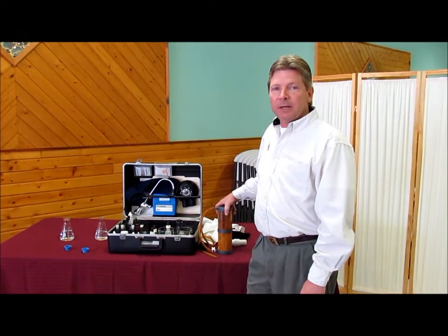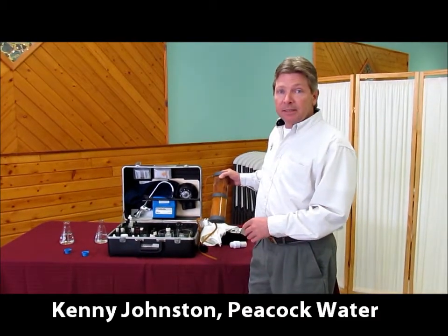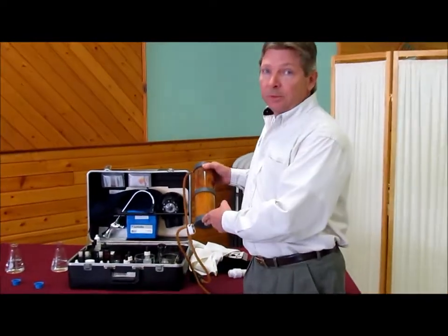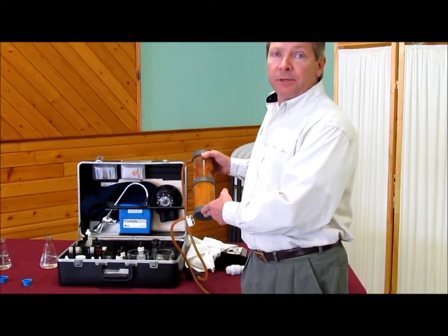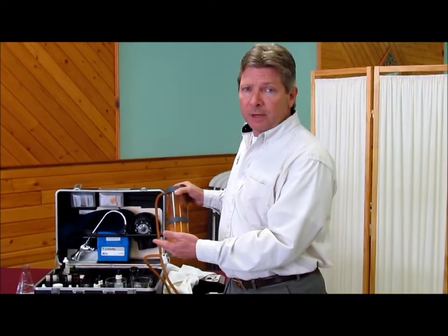Hi, I'm Kenny Johnston with Peacock Water Company, and what I'm going to demonstrate is a thing that we call the soak test. I have run water that was through a tap that's non-treated, through this resin cylinder, which we call our miniature softener.